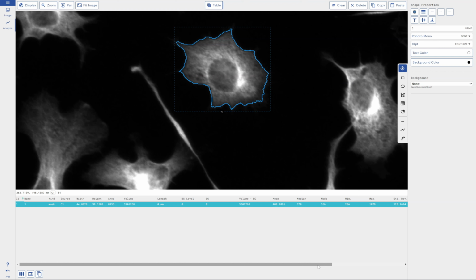So we can start doing area measurements and getting volume measurements, and of course, because this is built into our Phoretix suite of image analysis software, all of these different measurements can be exported, or copied and pasted to Excel. You can do further calculations or measurements with these, or have a place to store them if you want to do things like changes over time.